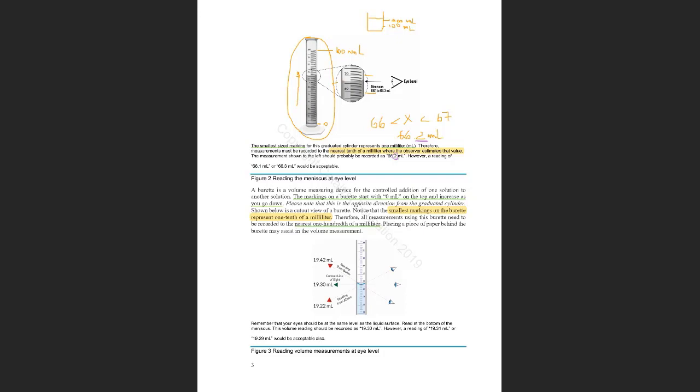Okay, and so basically the 0.2 is what we are referring to as having the most margin of error? Exactly. The number 2, which is the last digit of the number, is the one that has the error. The uncertainty. Yes, exactly. But what you have to know is that you can only guess one digit and stop there.